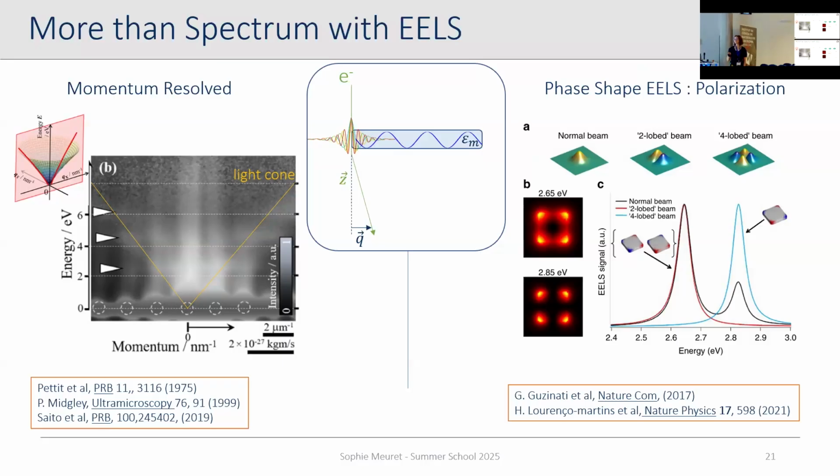Of course, if you do this with EELS, you also have access to some information that is not inside the light cone that, of course, you cannot resolve with cathodoluminescence. Both are complementary. I'm not saying otherwise.